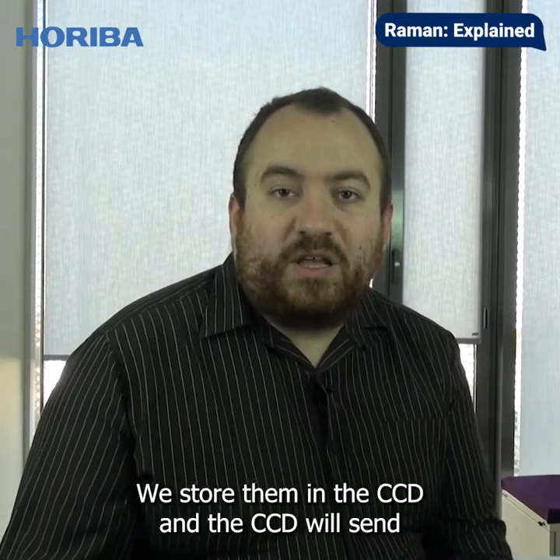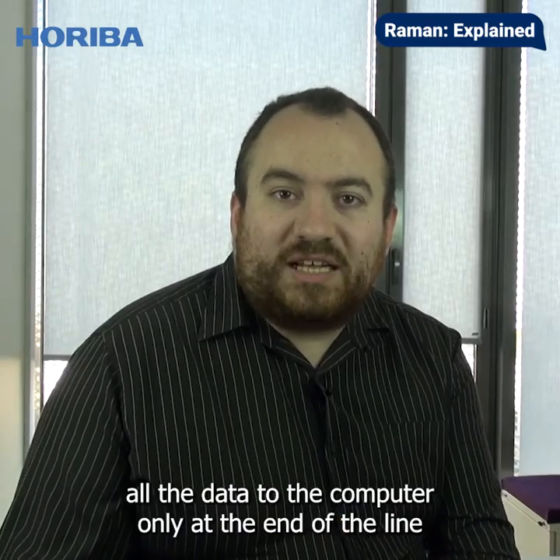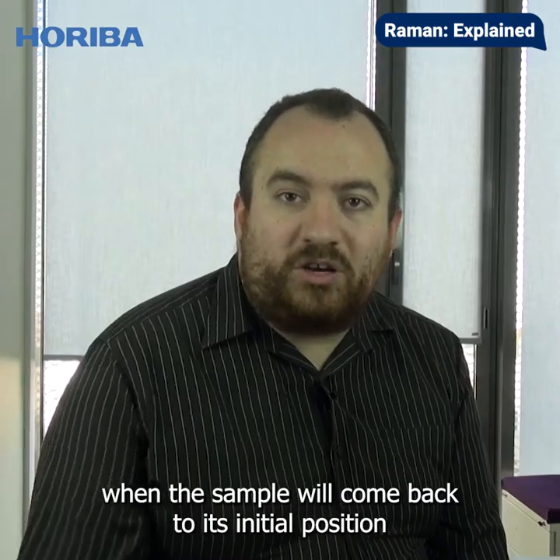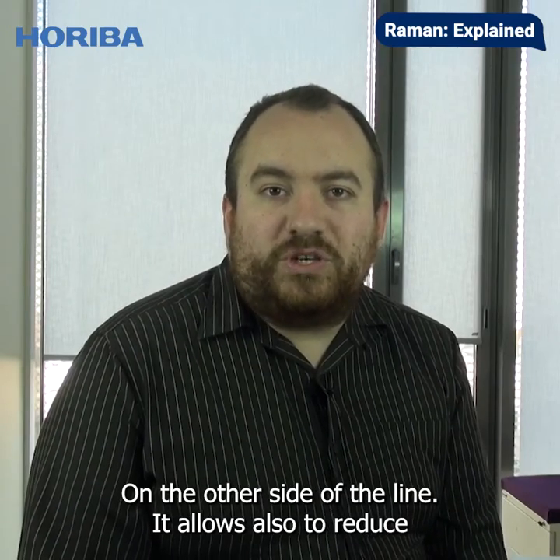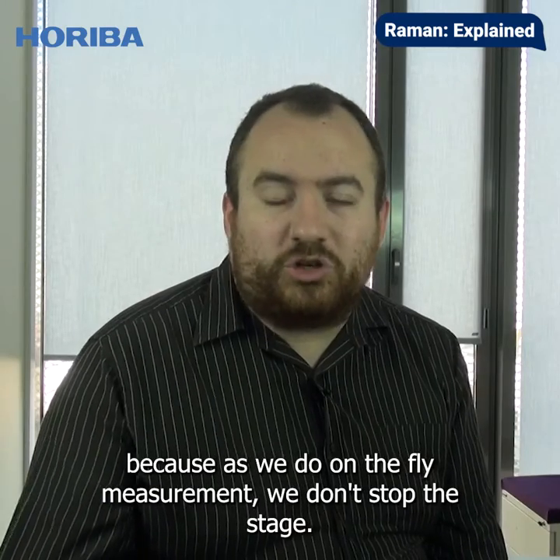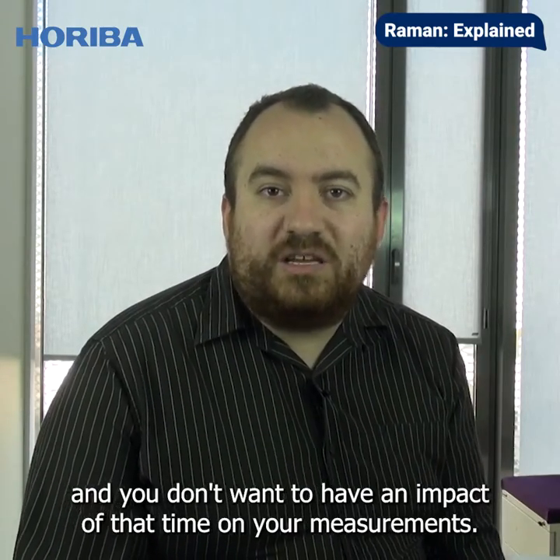We store them in the CCD, and the CCD will send all the data to the computer only at the end of the line, when the sample will come back to its initial position on the other side of the line. It also allows us to reduce the stopping time between the different points, because as we do on-the-fly measurement, we don't stop the stage. This is very useful when you have short acquisition times and you don't want to have an impact of the dead time on your measurement.